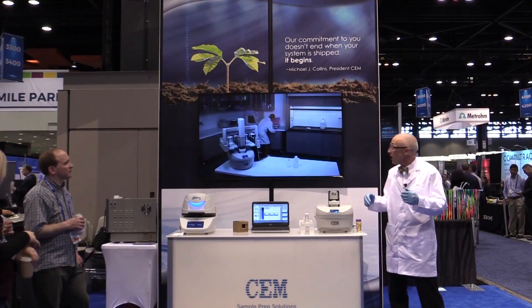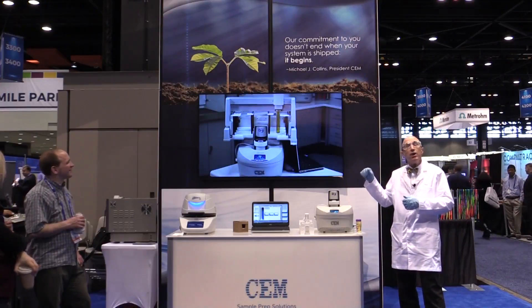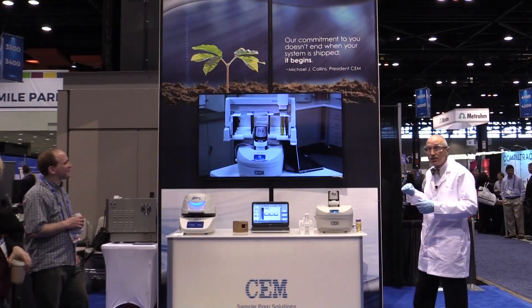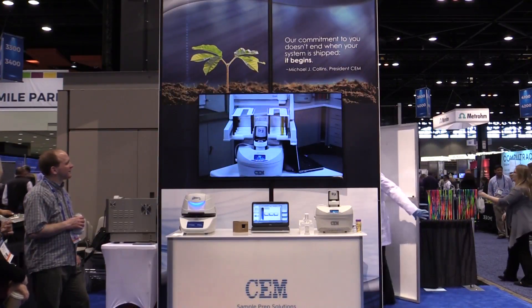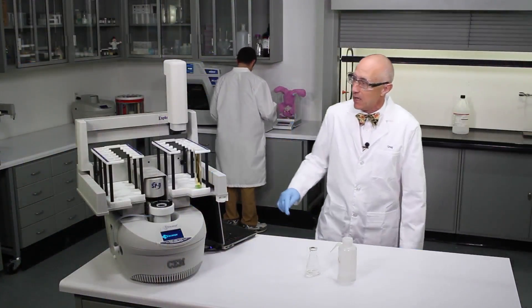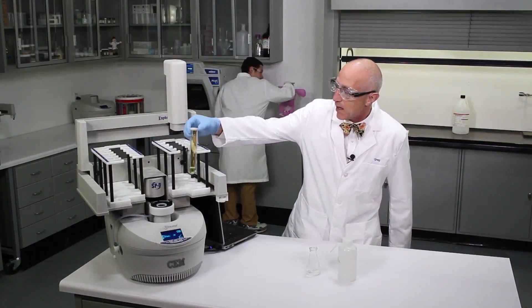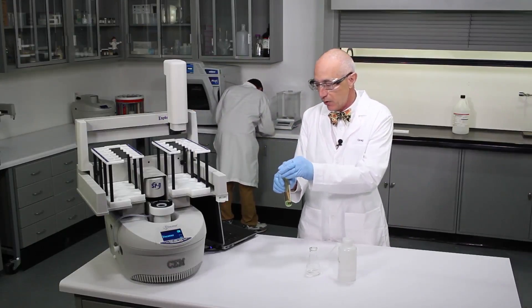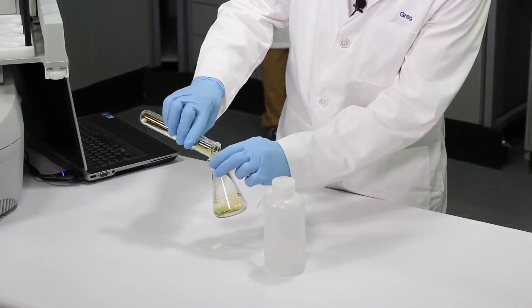Is our sample getting done? It looks like we're pulling out the sample. So let's go take the sample out of the system, transfer it to an Erlenmeyer flask, dilute it, and see if we've got a digested dry cheese powder. The SPD has returned the vessel with the digested sample back to the rack — there we have a slight greenish tint to it. Let's transfer it over to the Erlenmeyer flask and dilute it with water to see if we have a clear solution or not.